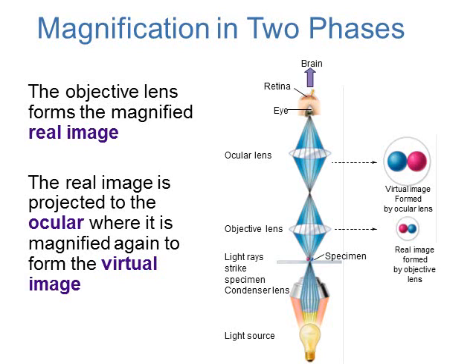In all of our microscopes, the ocular lens is 10x, so it magnifies 10 times. As the image passes through this ocular lens, it creates something called a virtual image. And this virtual image is inverted, so it's actually upside down and backwards to what is actually on the slide. And we'll be working with this in lab when we use the microscopes.